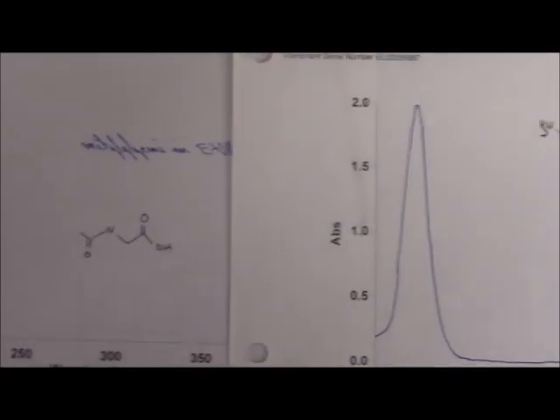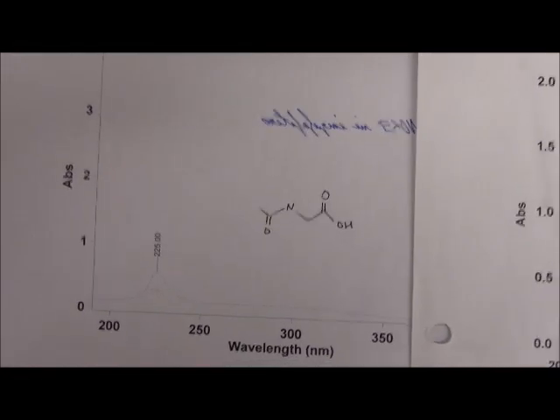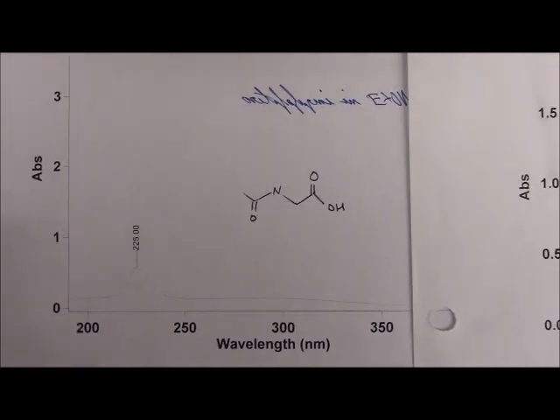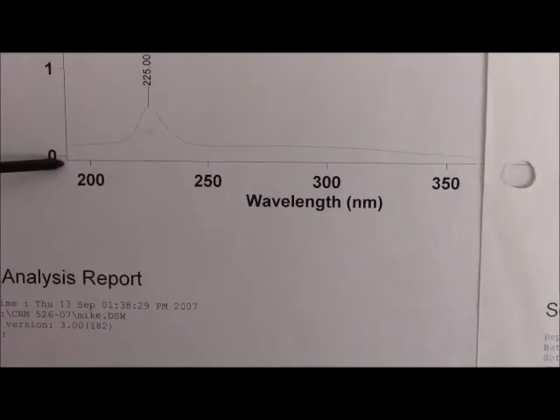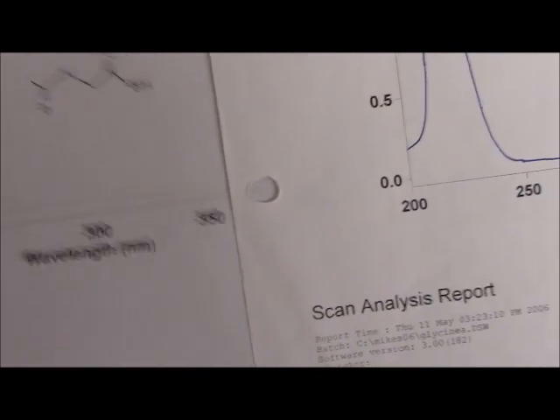Alright, I'm going to make some videos similar to Organic 2 for your spectra and discussion. So this is experiment number 1, which is the glycine. And I'm going to put my glasses on here, my actual glasses. So there's glycine. In the UV, it's run from 190 out to 400.